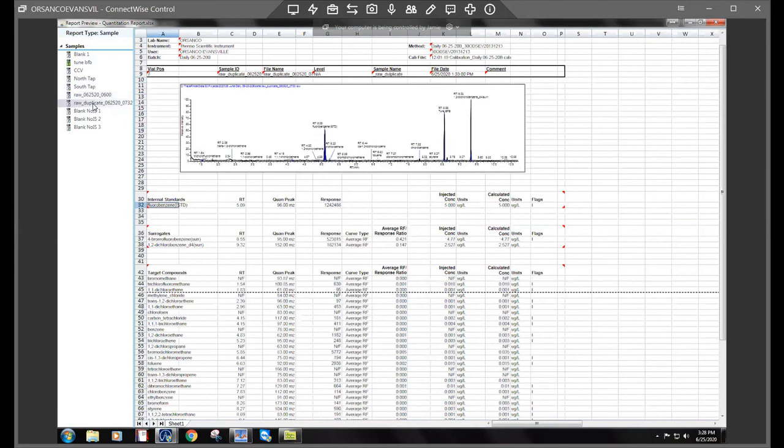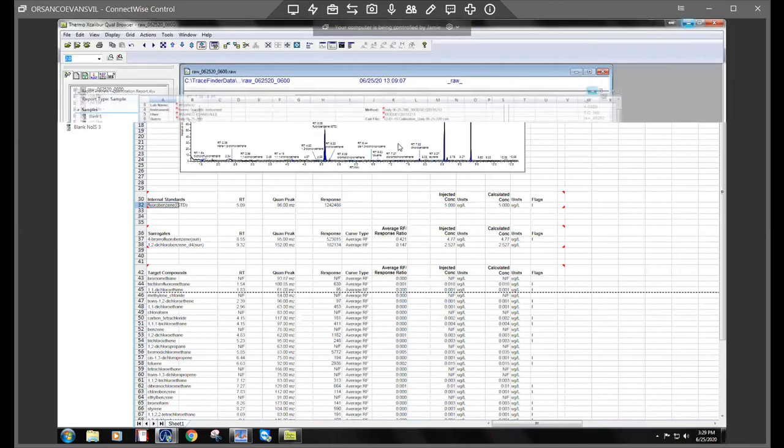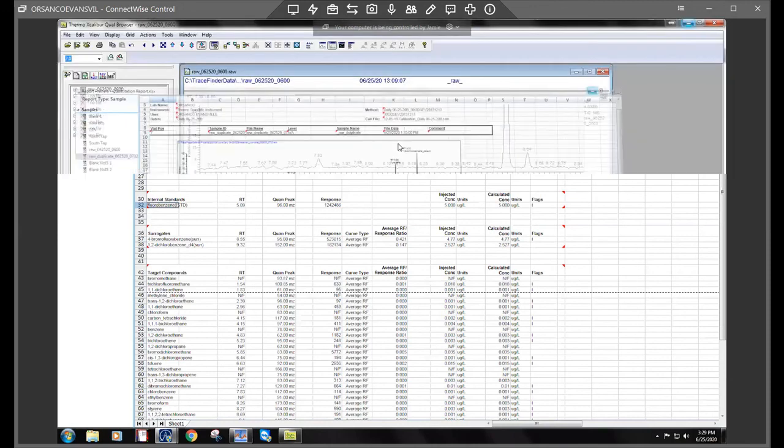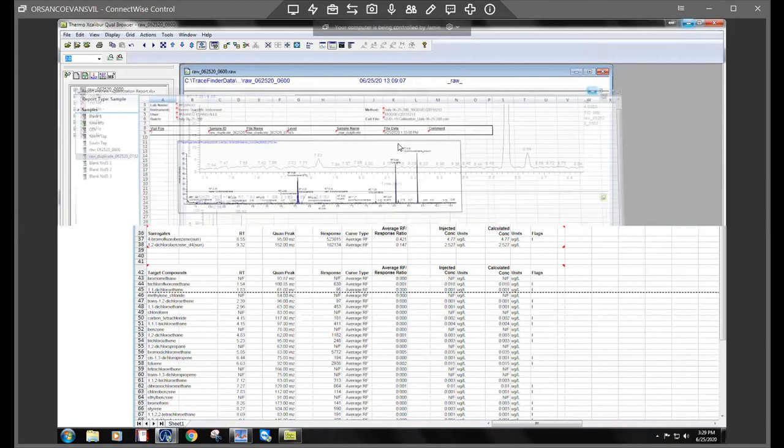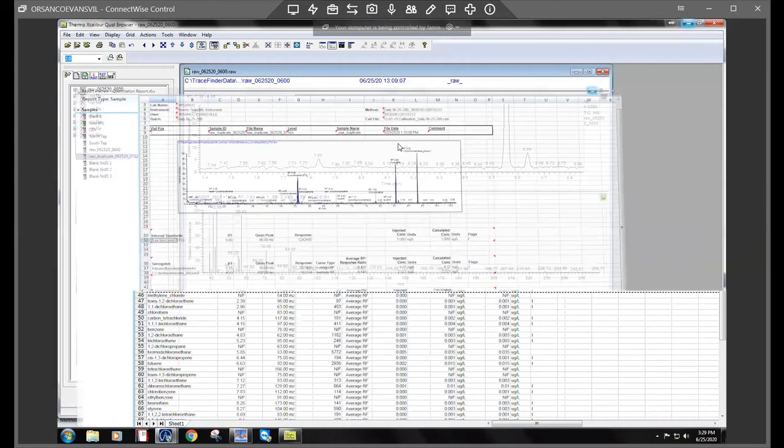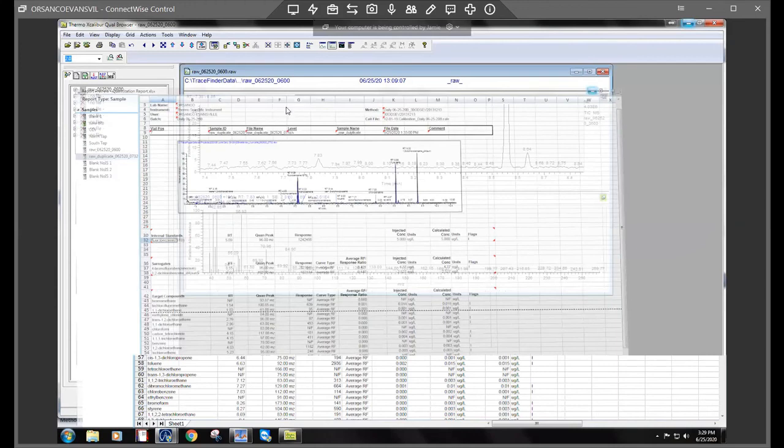But so that was kind of just the overall how you use the qual browser to investigate and to identify unknown peaks.